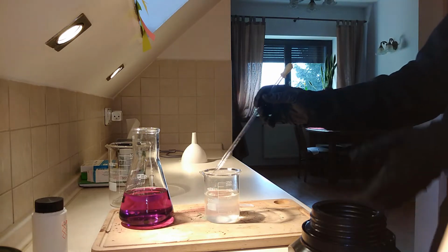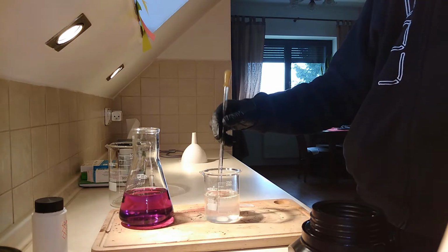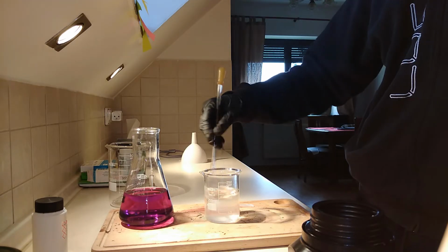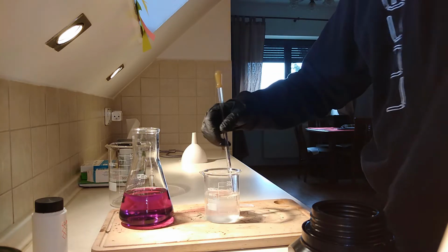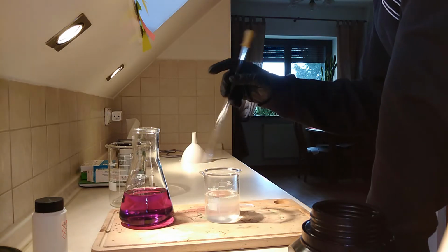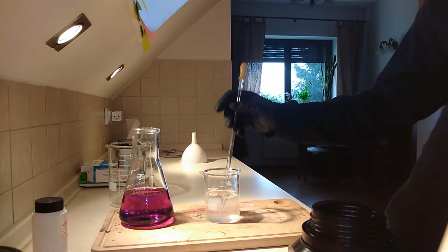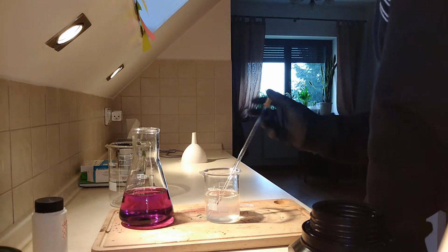With sugar, most of the sugar dissolves really well, but the last part is a struggle to dissolve. You just have to stir it, and with this motion you have to break up the chunk of sugar that forms in the middle. So, yeah, it's now dissolved.